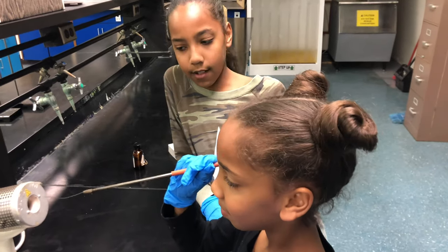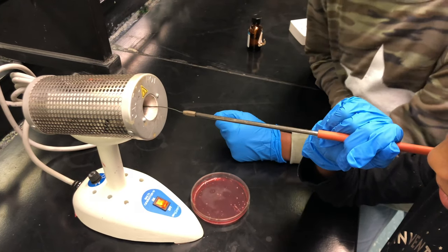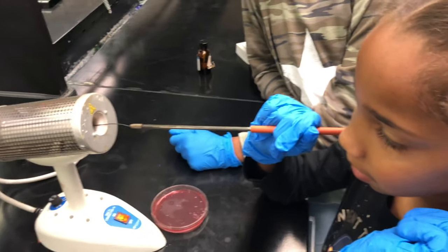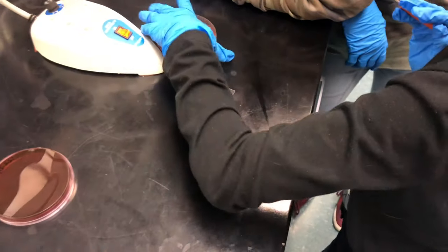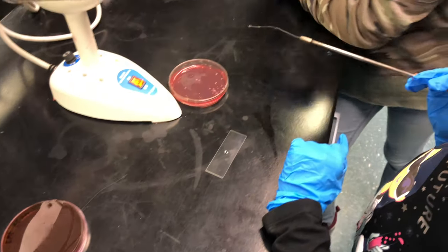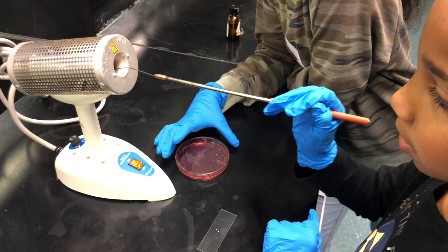Now we're gonna bring you through the process of staining bacteria. First, you have a transfer loop and you're gonna heat it up — this thing is called the bacticinerator; it sterilizes the loop. Afterwards you get some water, rinse it off, and put a loop of water on the slide. Now you're gonna heat the loop up, then cool it in a spot of the agar that doesn't have bacteria.